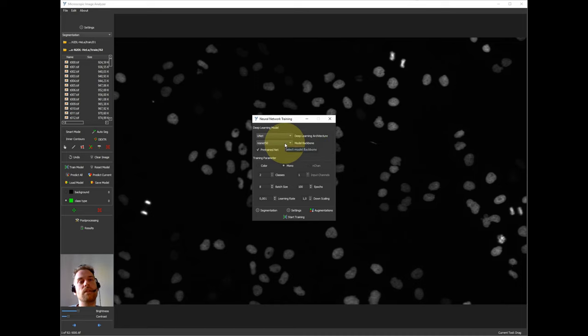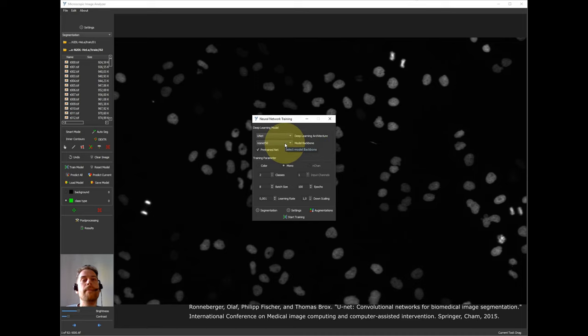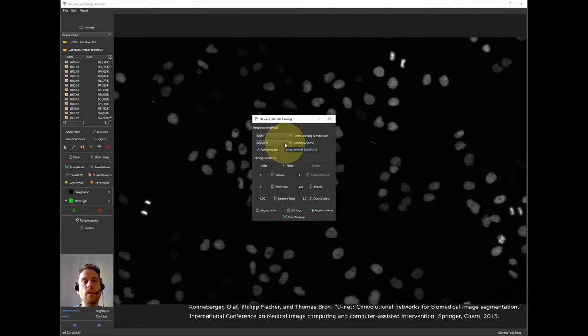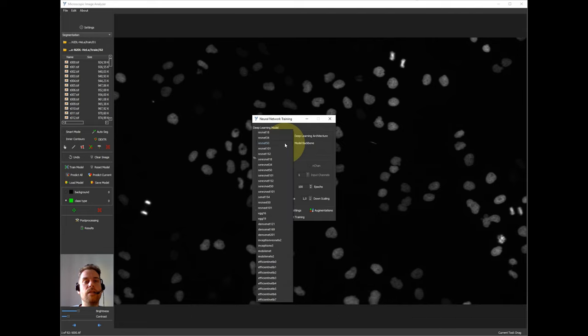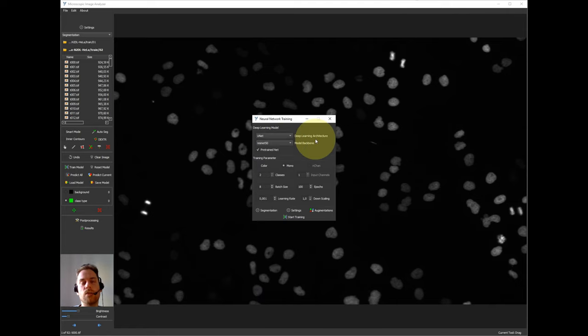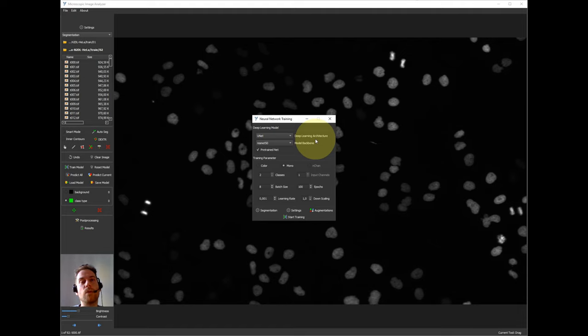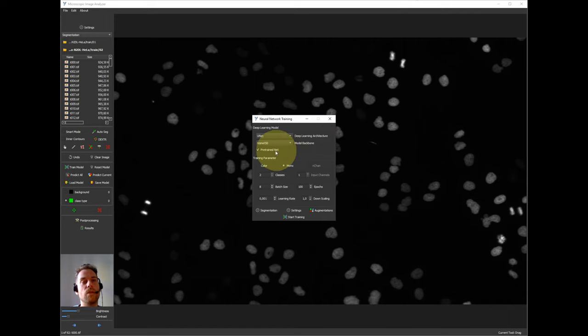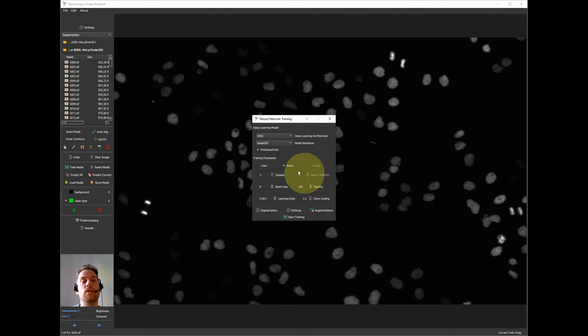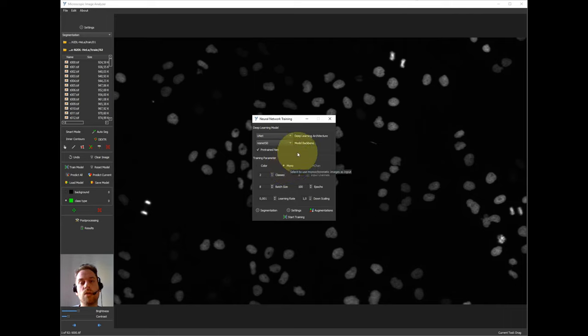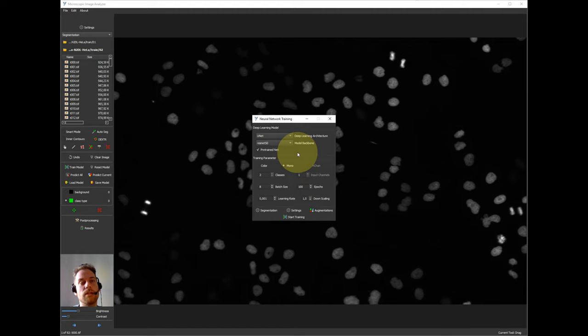We have different options for deep learning architecture. I will stick with the default here, the U-Net, which is very popular. There are also several options for model backbones. If you're not familiar with that you can check the manual. There is a reference for all of these and they are ranging from smaller models to bigger models. Usually you trade off the training speed and prediction speed versus performance. If you have only a small data set I would rather recommend using a smaller model. If you have a bigger data set probably go with a bigger one if you have the computational power. All of these models can be used with pre-trained weights that are trained on a huge data set.